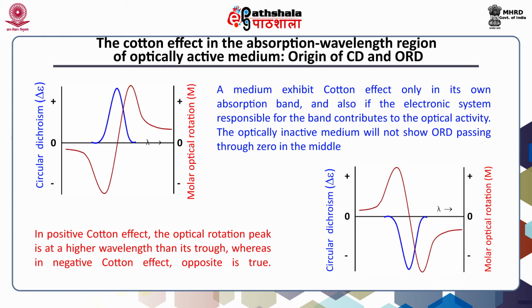This could have several ramifications in the experimental setup and the amount of information gathered. The CD band is located where the medium has a normal absorption band and hence describes the electronic system more accurately.